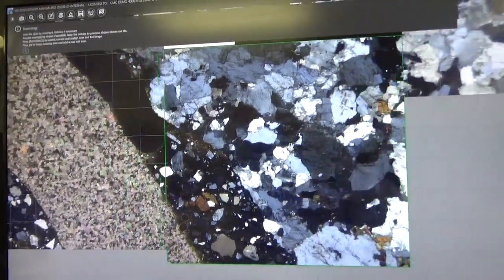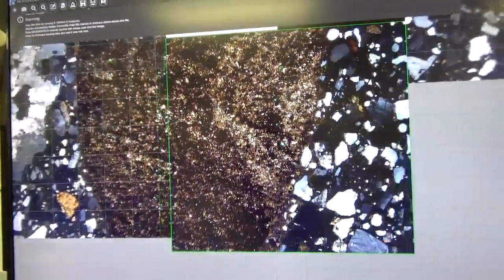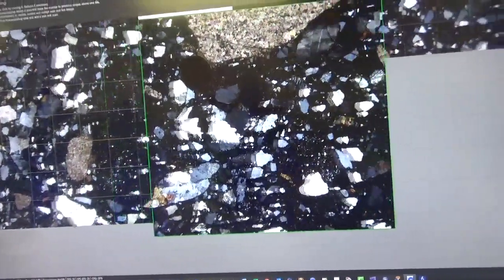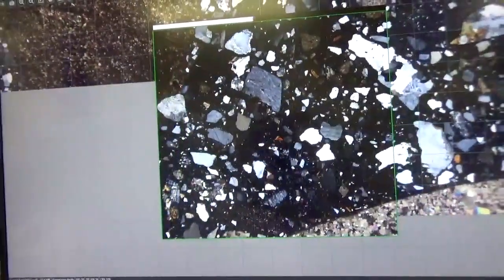The dolomite, then came a granite, limestone, all the crushed stone particles, then you have the fine aggregate. So you can find out all the information from your scan. 20% overlap. Every time you do the next row, you make sure you keep the 20% overlap during your scan.